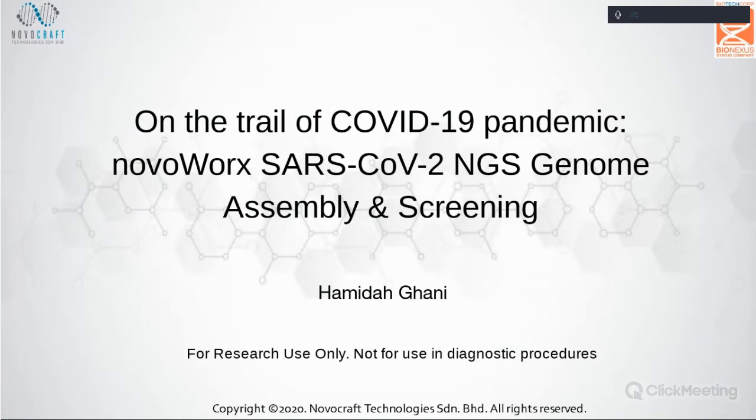Before we start, I want to highlight that our viral NGS application is for research use only and is not suitable for diagnostic purposes.